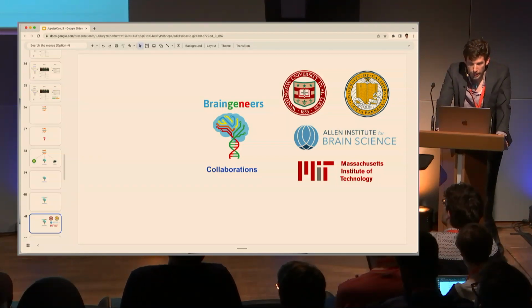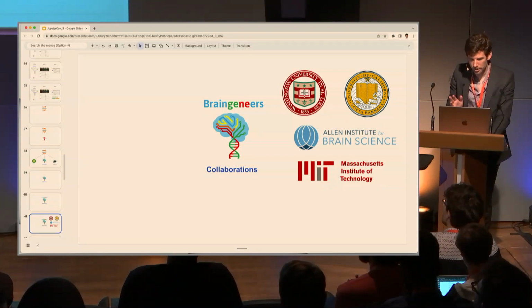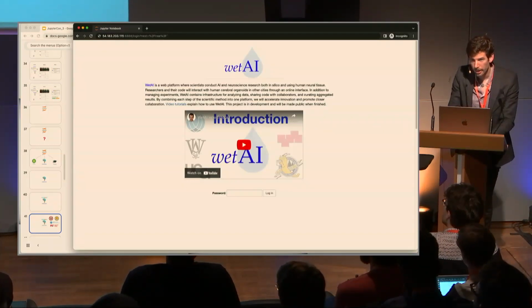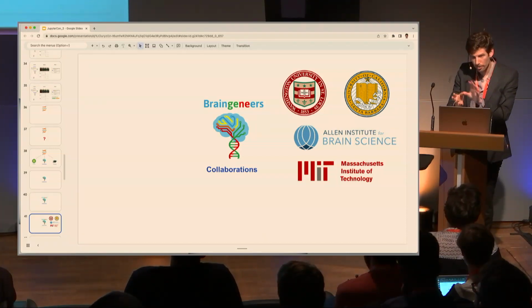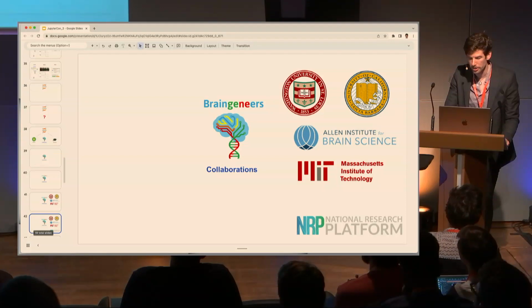And so, again, because this is a website, someone from MIT can log in, use what we have to design their experiment. Also, they set up Jupyter websites on their place, and then we log in and control experiments remotely. So it's incredible for collaborations.